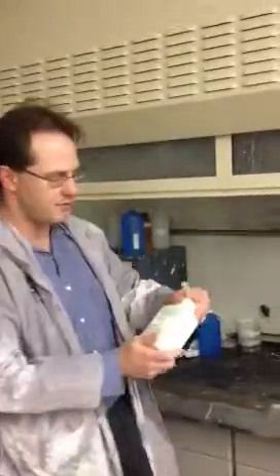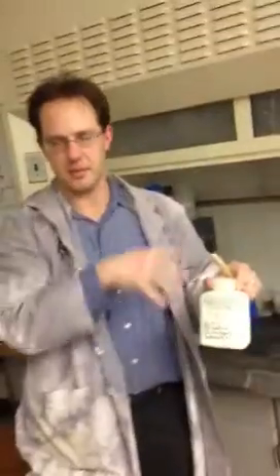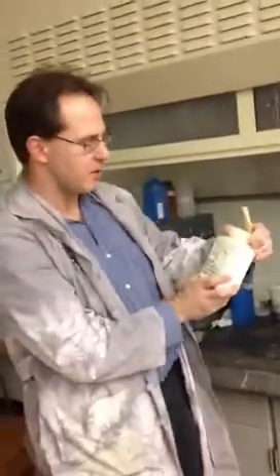We're going to create Hungry Dragon. Inside of this test tube is potassium chlorate, KClO3. If you look on the label, which I've drawn, because I have a big, huge container, I took that big, huge container and condensed it down to a smaller container.